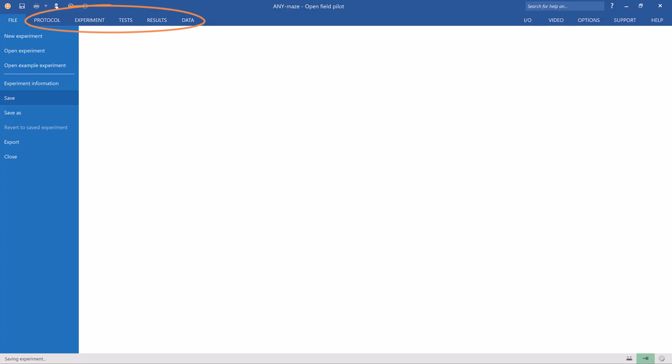In the future, you might want to extract the protocol from a file. To do this, simply open the experiment file, navigate to the protocol page, and save it. Lastly, you can configure your copy of any maze to automatically save files on exit without asking for confirmation. In fact, this is on by default. To check, go to Options, Filing.